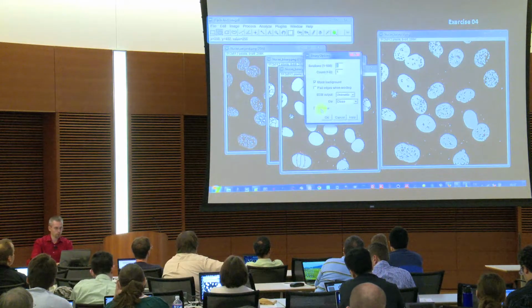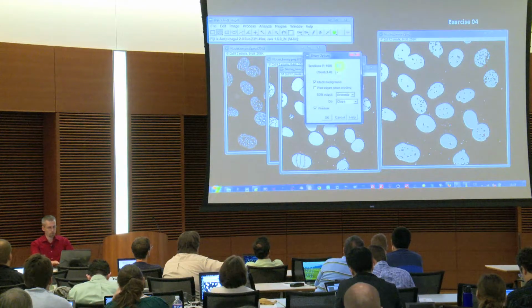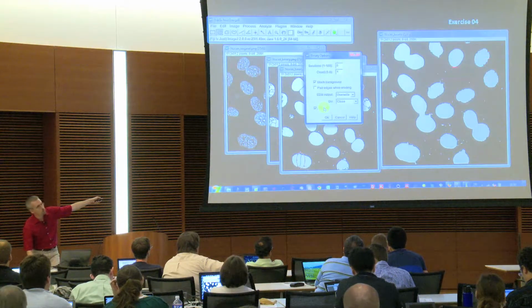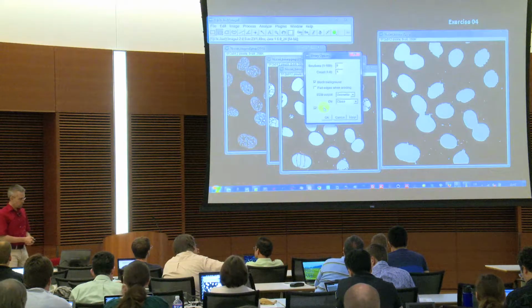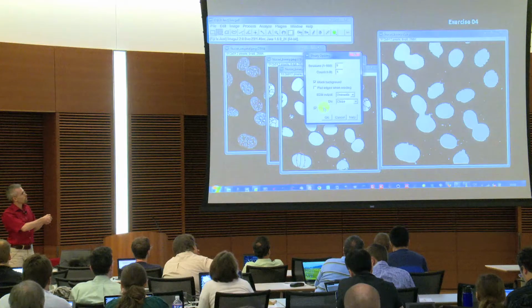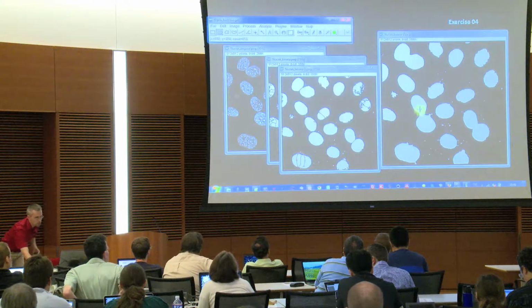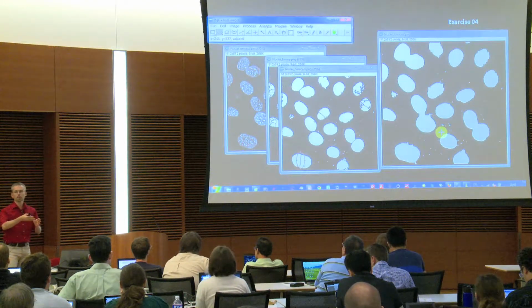So let's say if I go to preview, then you see if I do that one time, it does already to some extent. And if I do that 5 times, then you see that they're actually nicely closed. And these two at the side here are also rather, so have a better completeness than beforehand. But you see also already that we get slightly these connections to smaller particles, and at some points you have the feeling that it's a little bit blocky. So what comes next is I need to still separate them and also get them a little bit more roundish.